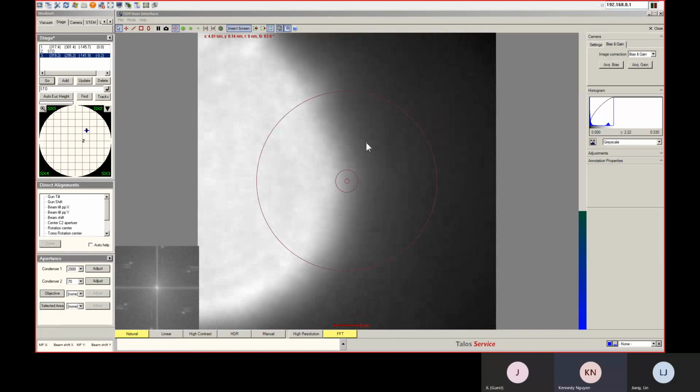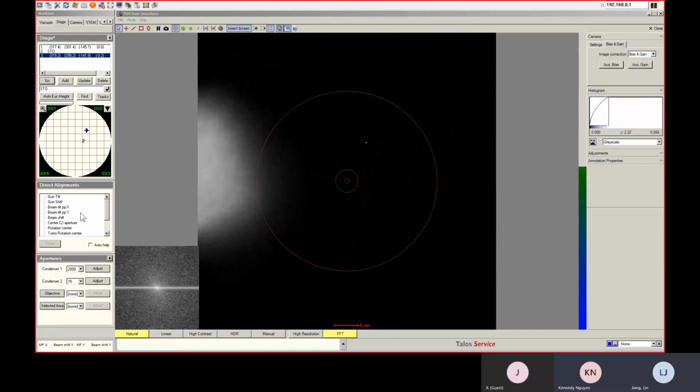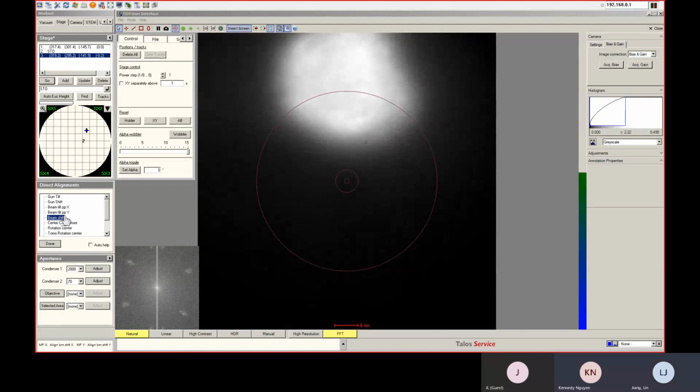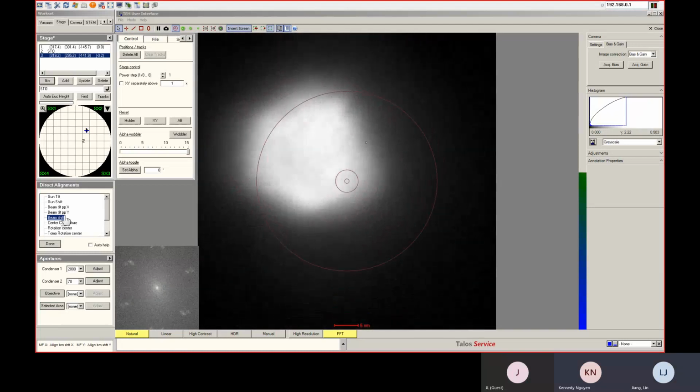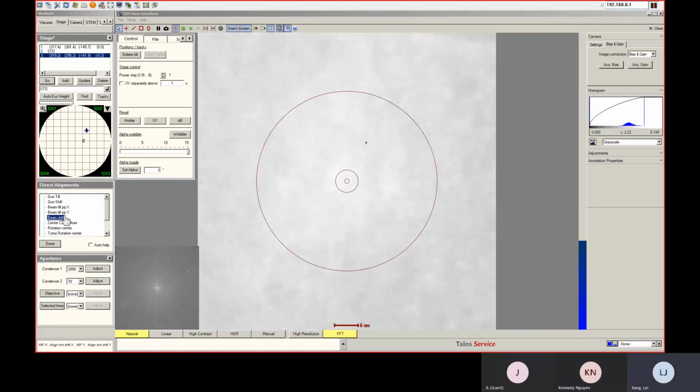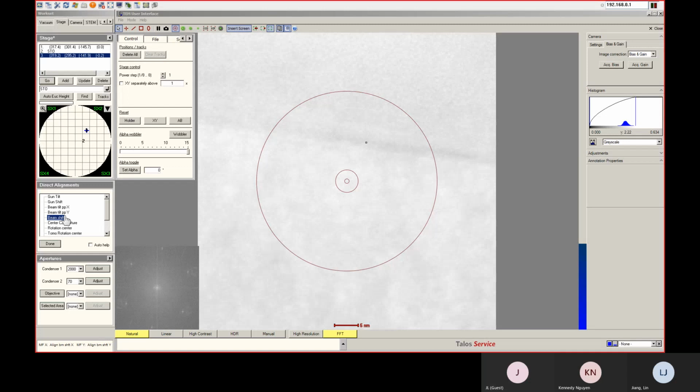So for high res, we adjust between PP, the beam tilt and the rotation center a couple times, right? Fine adjustment, yeah. Are we in an amorphous region, or do we need to focus to see something? Yeah, we need to focus. This is the crystalline region.